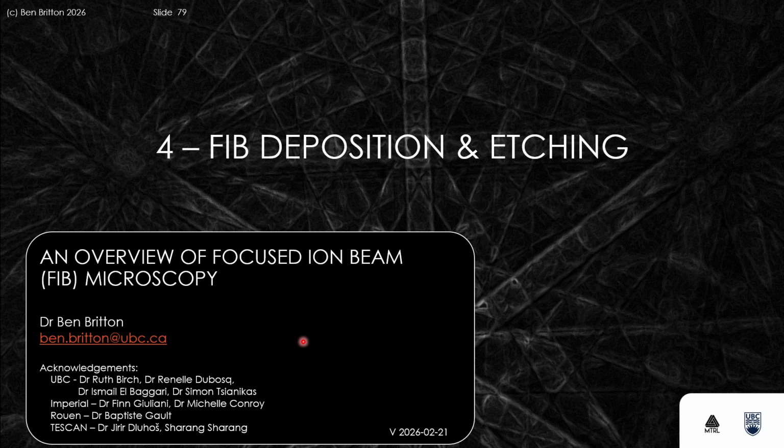So that brings us to the conclusion of Lecture 3. In Lecture 4, I'm going to look in more detail at the gas injection system that's going to be used for deposition and etching of our materials.